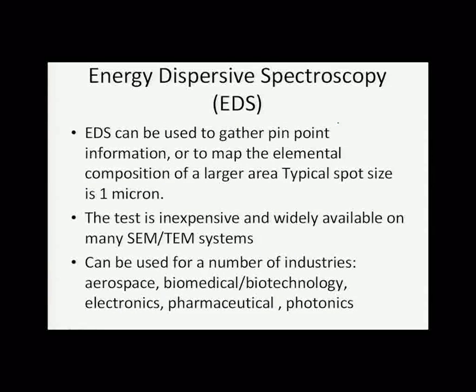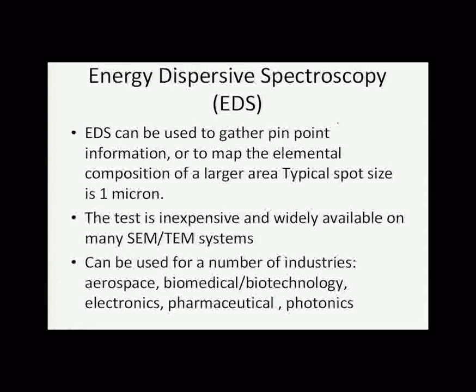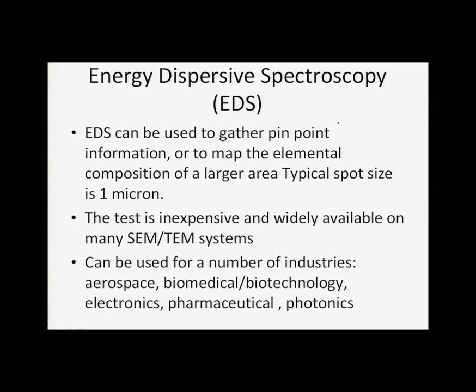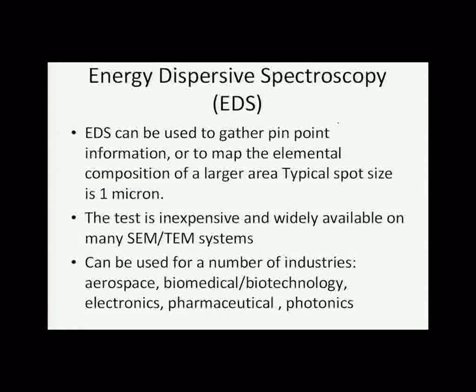EDS is inexpensive and widely available on many SEM and TEM systems, and can be used for a number of industrial applications such as aerospace, biomedical, biotechnology, electronics, pharmaceutical, and photonics.